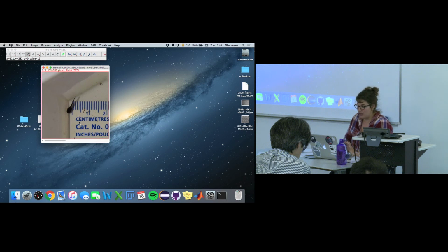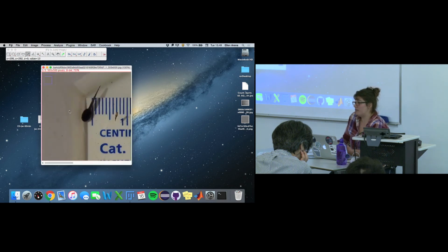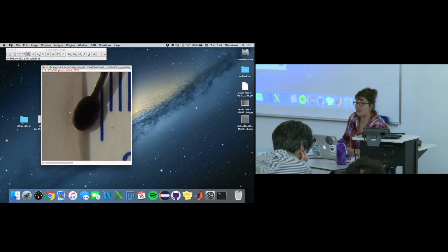If you need to delineate the tadpole body, the shadows being cast are going to cause issues, as well as these blue markers. Not to mention that if you zoom in on the tadpole, because of the resolution of this image, you can't answer any questions based on these smaller features, right? You'd actually have to acquire an image at a higher resolution.